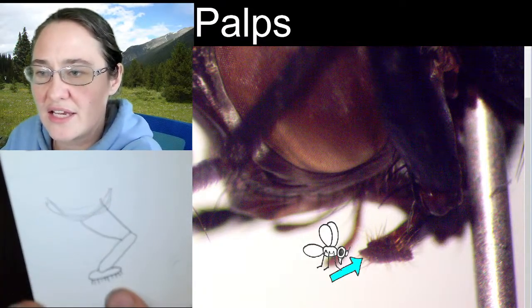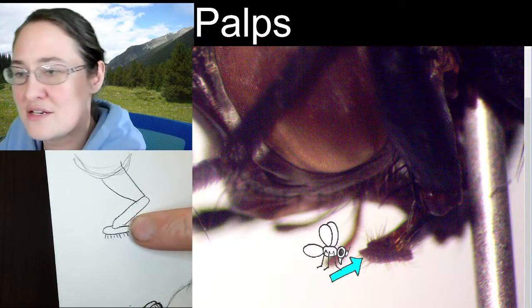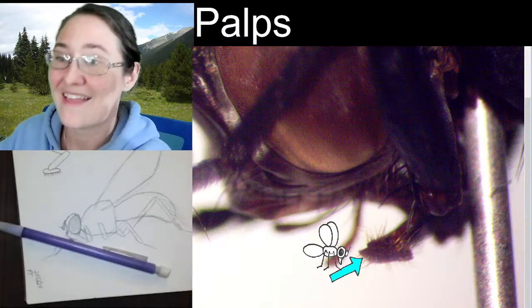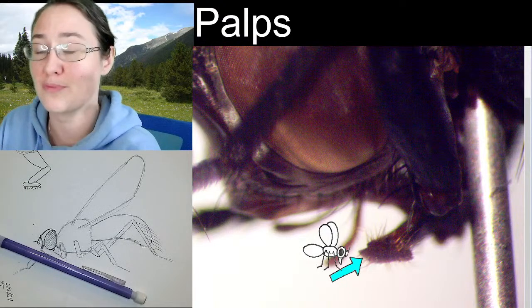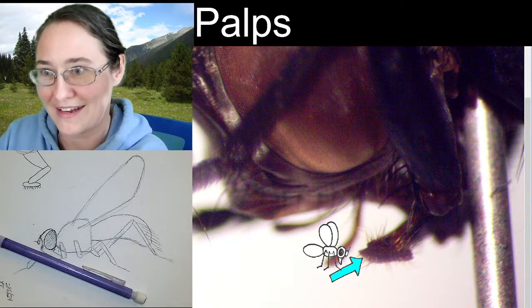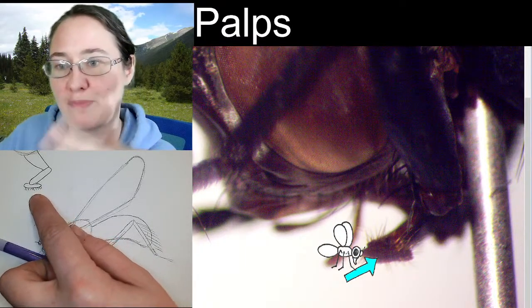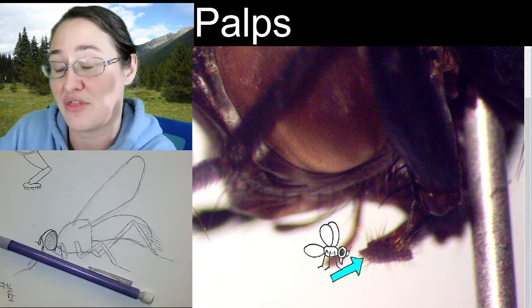Alright, so that is kind of what we are seeing here on the fly, but we're not seeing this part. We're just seeing the end, and the sponge on the bottom of the mouth part. So flies, when they land on food, generally they're tasting with their feet, and then if they like what they taste, they regurgitate onto the food. They spit up enzymes onto the food that start to break it down. Essentially, they start their digestion process outside of their body. So then once it becomes kind of a goopy muck of food, they'll use the bottom of this mouth part like a little sponge, and they sponge up their food. And all of these little uptake hairs are going to help with that.